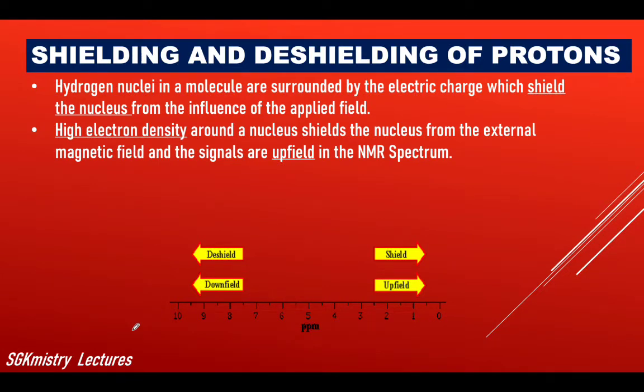In this video, I'll be explaining how you identify the position of the peaks in the NMR spectrum, and also what the different factors are which affect the position of the peaks in the NMR spectrum of any molecule.